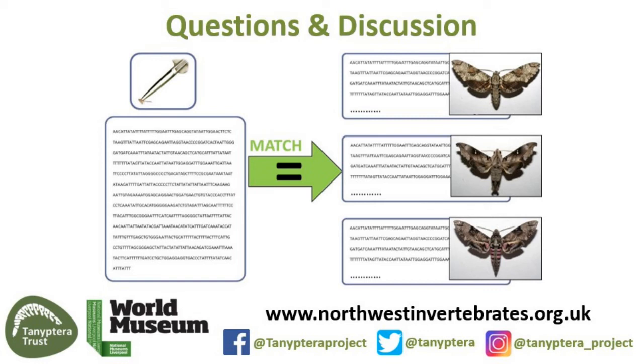Okay. From Rod Hill, why use only one region of the gene, i.e. can you use a second short region to validate the screening, or is the specificity of the selected region sufficient to offer the precision and selectivity required?